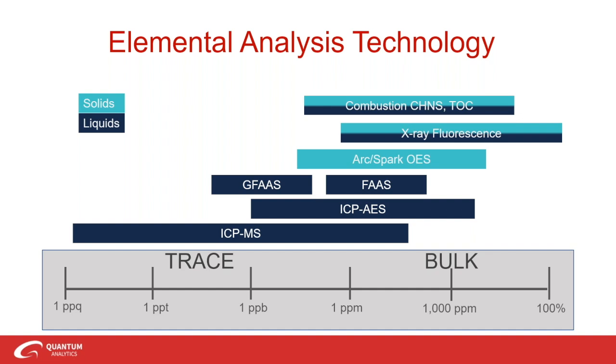For quality and process control, many elemental analysis techniques are available, right? Including XRF, and these are used all across the board in many fields. Now, each of these techniques has several advantages and some disadvantages, for you to know when to use one and when to apply the other.